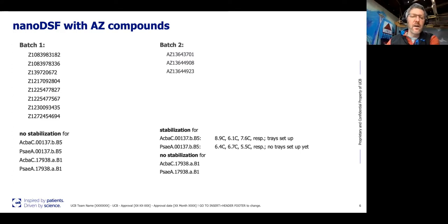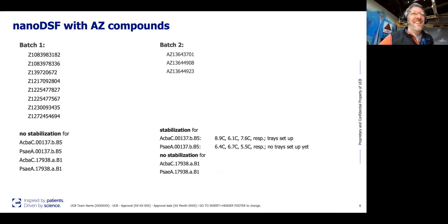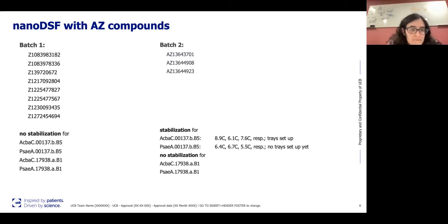Since I see there is distinct interest, I can request crystallization setups right away today. Well, that's Joe speaking. I'm not sure about the rest of the team. When you say distinct interest. Well, there is one Acinetobacter baumannii structure for Mur C with AMP-PNP, but nothing else.